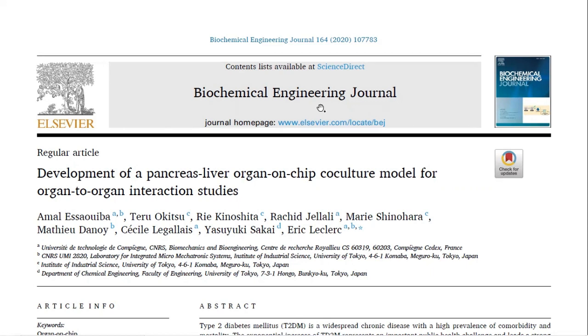In this case, the microfluidic organ-on-chip culture improves the exchange and transport of nutrients, oxygen, metabolic waste, hormones, and other chemicals, and creates physiological-like situations such as liver zonation, shear stress, and chemical gradients. Cultures of two or more organs in separated microbioreactors or microchips are connected by soluble factor exchange through the microfluidic network. The potential of this technology for liver and pancreas interactions via insulin-glucose regulation is studied in this article.